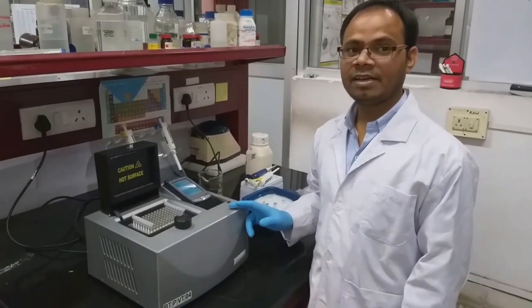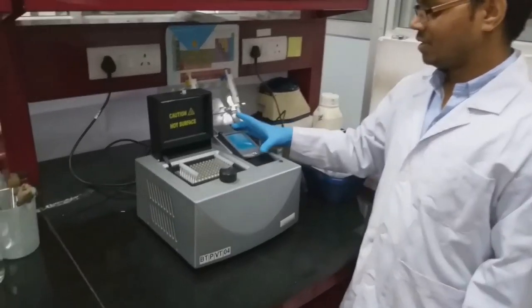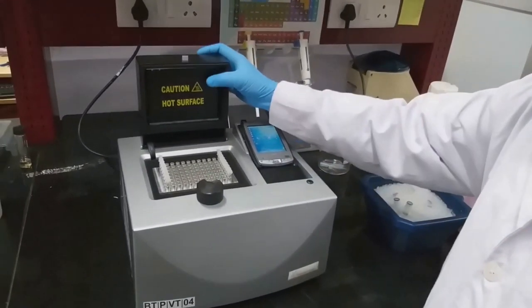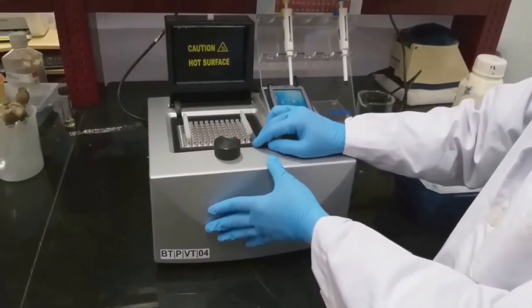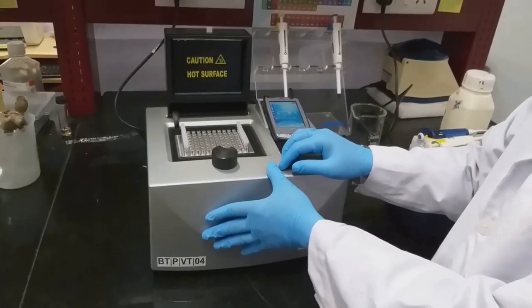This is an earlier version of a thermal cycler which contains a display unit where we can observe the parameters and change the parameters. This is a hot shield, this is the sample holder, and inside there is a Peltier system which can maintain the temperature fluctuations.